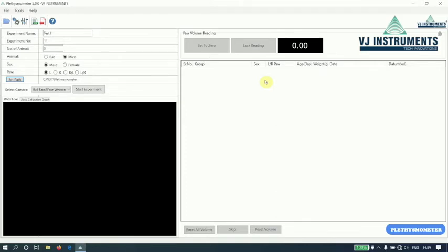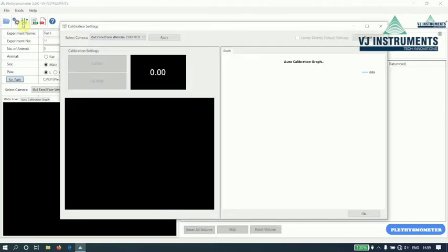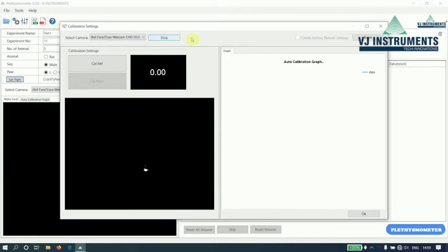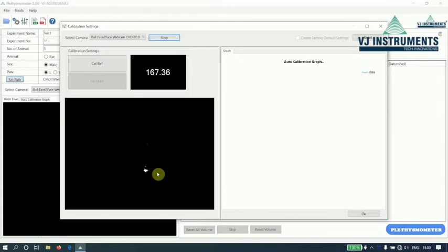Let us now perform calibration settings. To perform calibration settings, click on the option available in toolbar. The calibration settings window appears. Select the camera of the device and click on Start. Once we click on Start, the bubble appears. And before inserting any cubes, click on Cal Ref button.